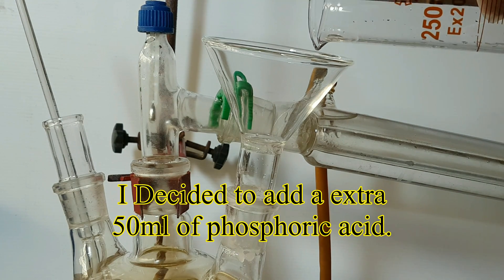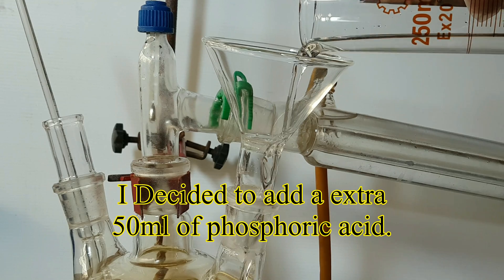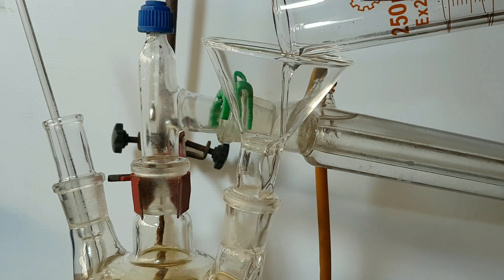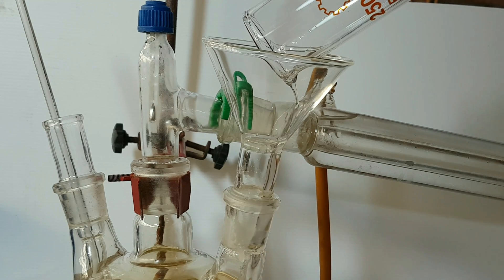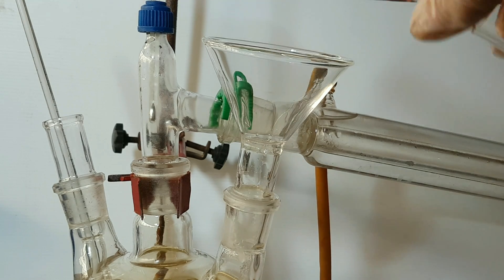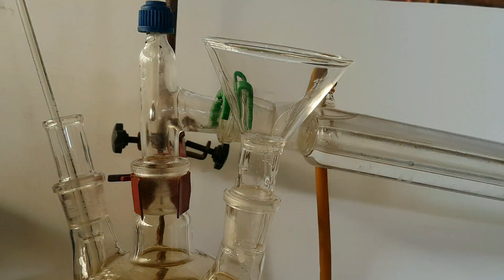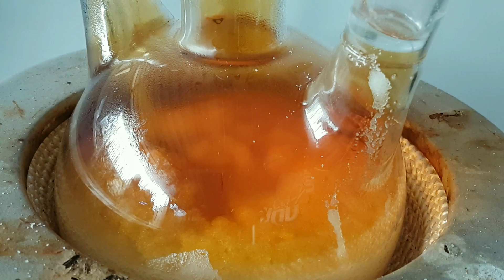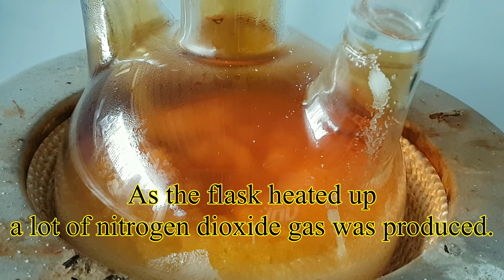I decided to add an extra 50 ml of phosphoric acid. As the flask heated up, a lot of nitrogen dioxide gas was produced.